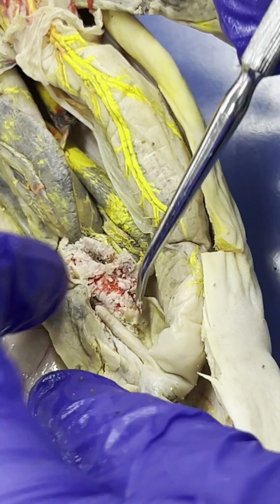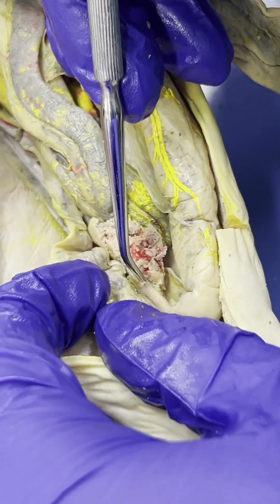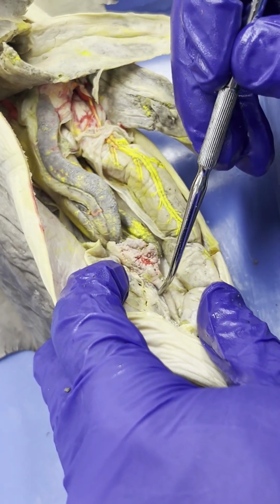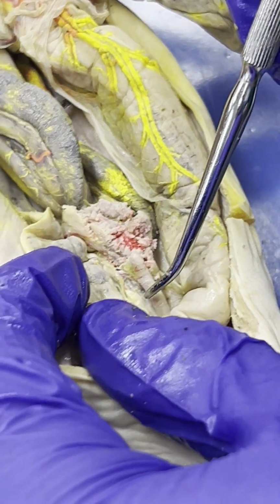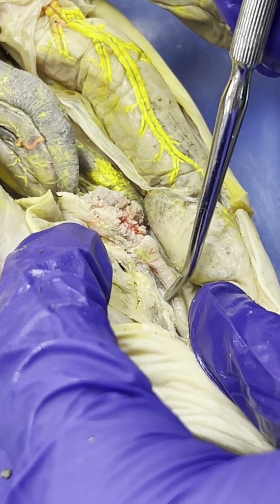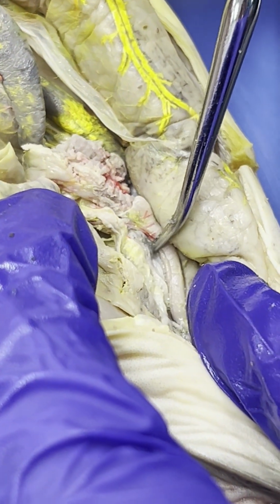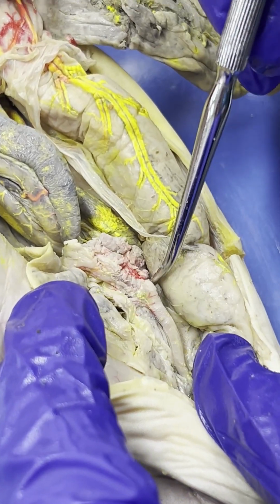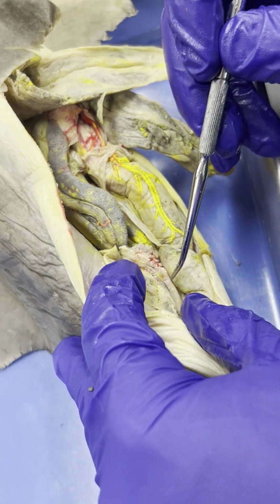Okay? And also how is this rectal gland attached to the body of the shark? It's through the mesorectum, which is a type of connective tissue. So again, rectal glands and the connective tissue, kind of hard to see, but there's going to be connective tissue right here. Again, that's attaching the rectal gland to the rest of the body. If I kind of expand it a little bit, you could see it. Okay. All right. So rectal gland, mesorectum.